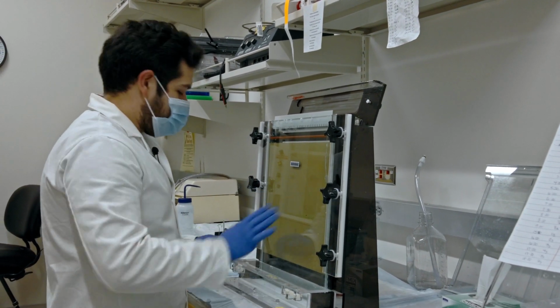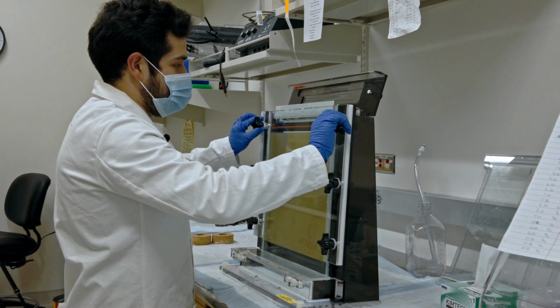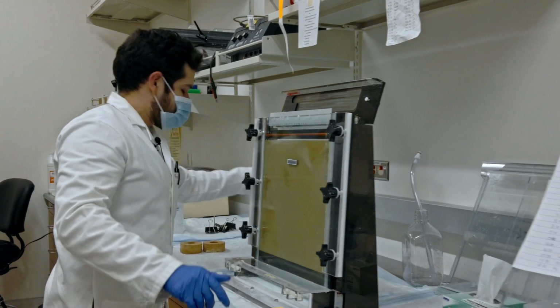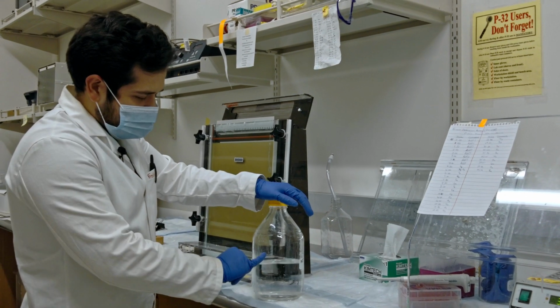Because of course, you don't want your running buffer actually going through the back, because this back portion of the aluminum casing of this gel box gets quite hot, and you might start to hear crackling and other noises, and it could unevenly heat the gel, and it could cause damage to the glass pieces themselves. So make sure that there's a nice tight seal in the top. So let's test to see if we've made it tight enough.